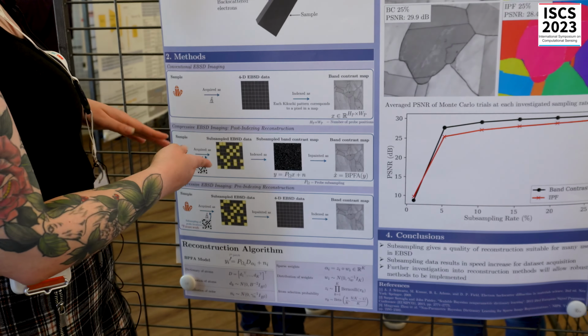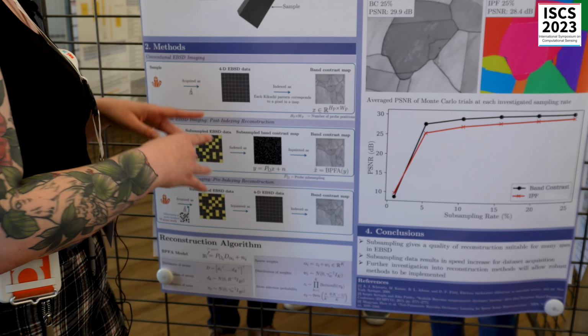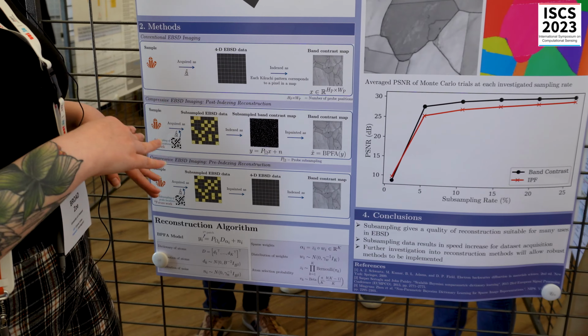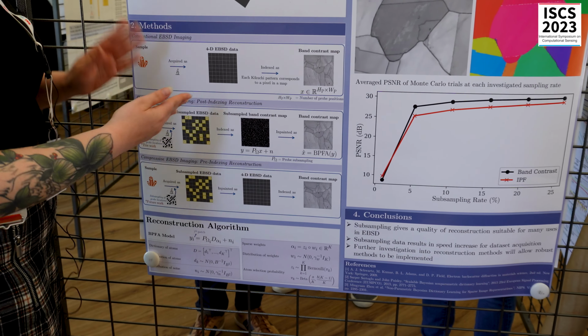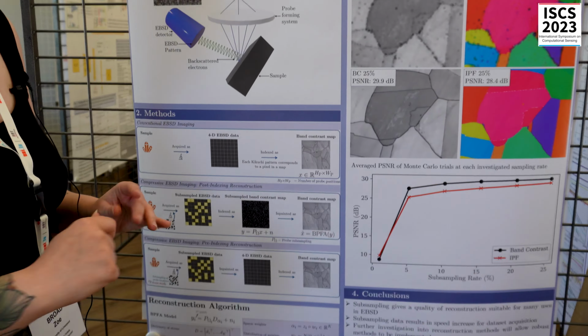There's a different way that we can do it called pre-indexing reconstruction, where we inpaint the EBSD patterns, but really we're looking at that as future work. So down here is our BPFA model. If you'd like to know more about that, please talk to Jack Wells.